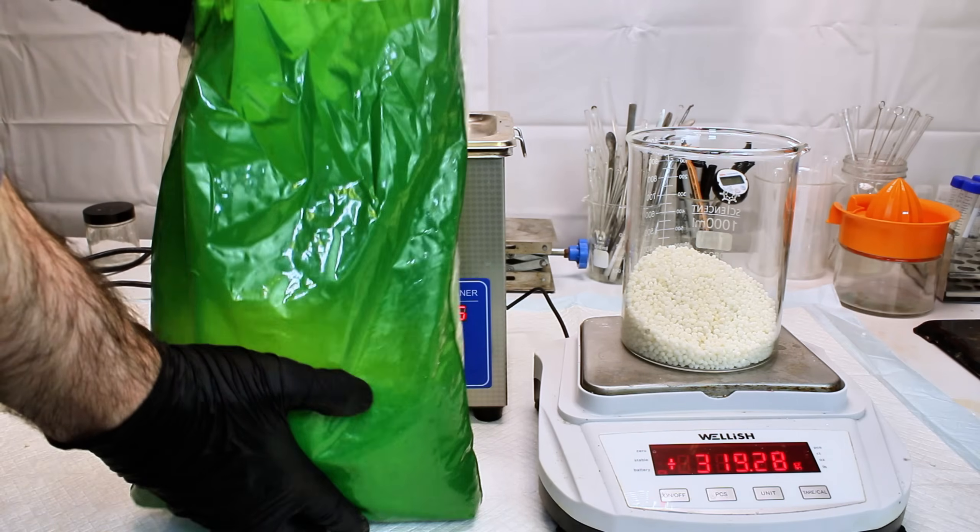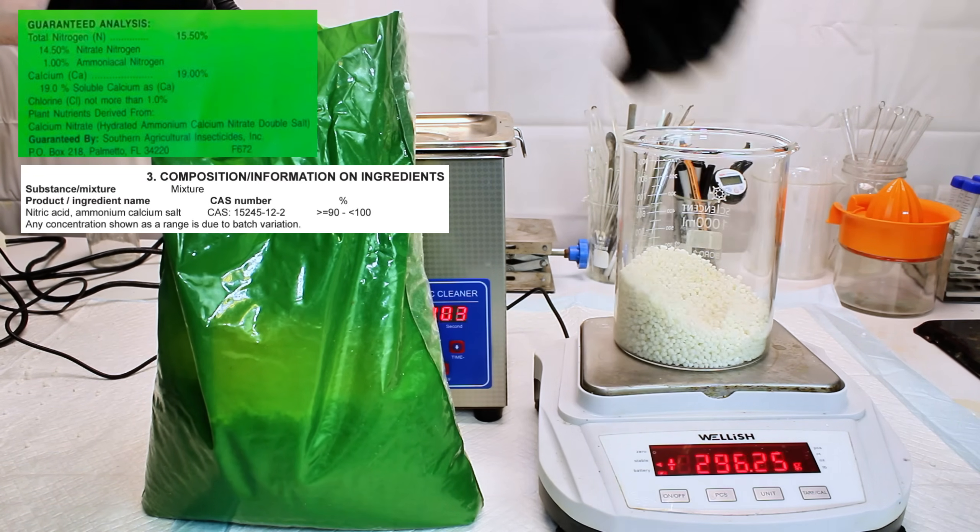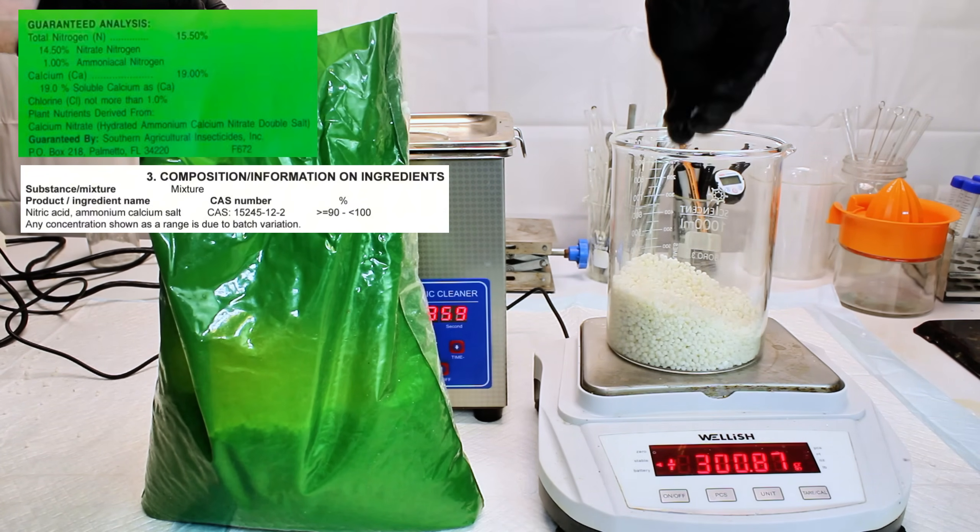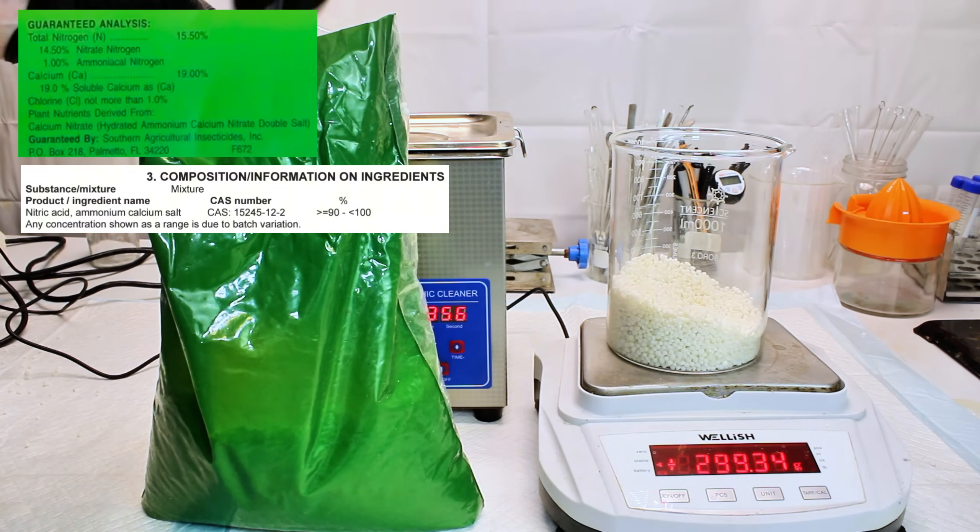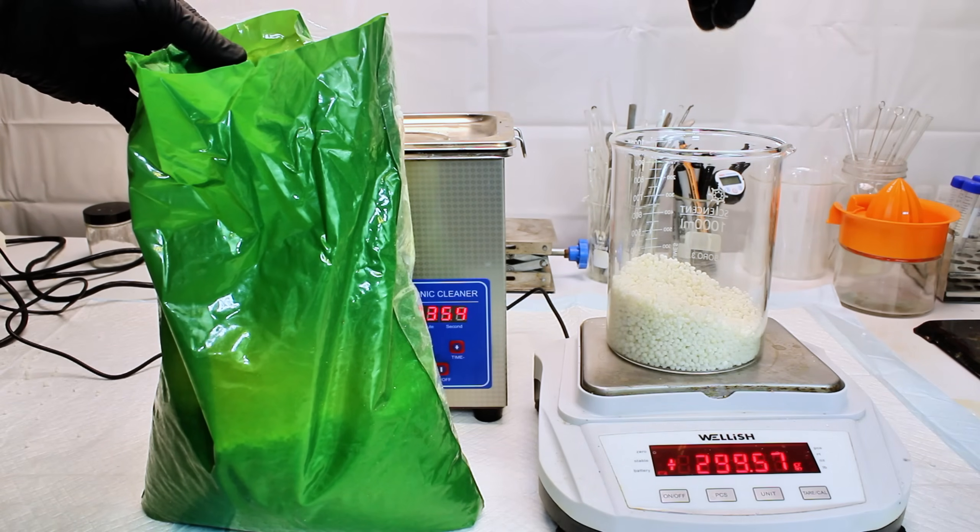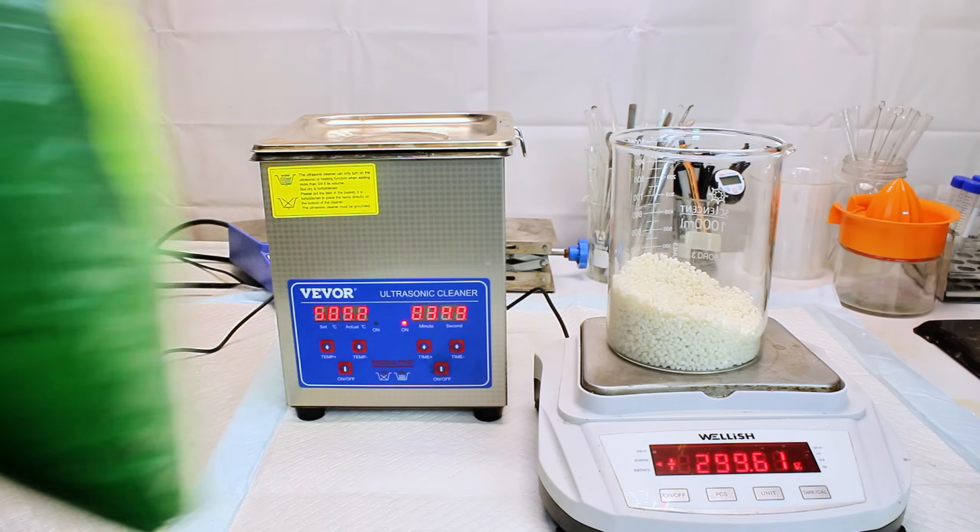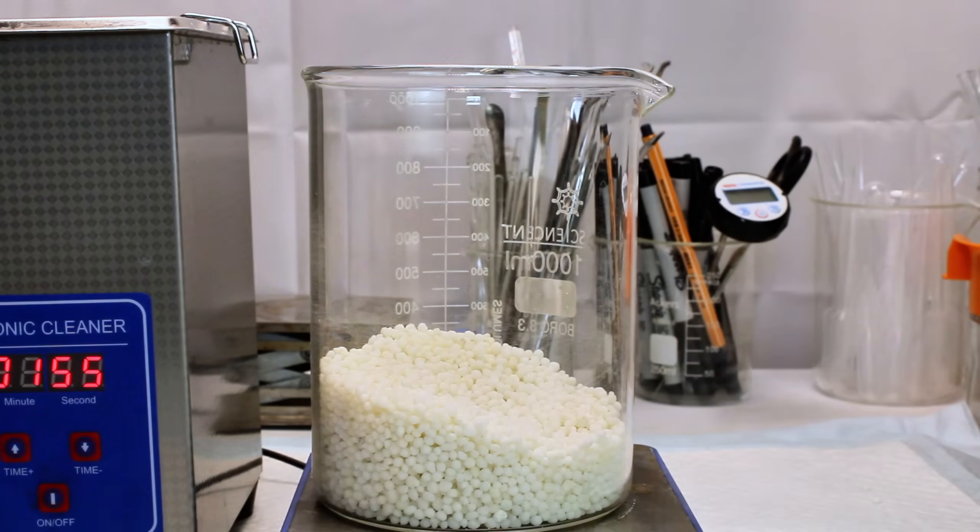If you look closely at the label or on the manufacturer's website, you can see that this product is actually something called calcium ammonium nitrate, or CAN for short. Calcium ammonium nitrate is vastly preferred in fertilizers, as pure calcium nitrate is extremely hygroscopic and nearly impossible to crystallize.